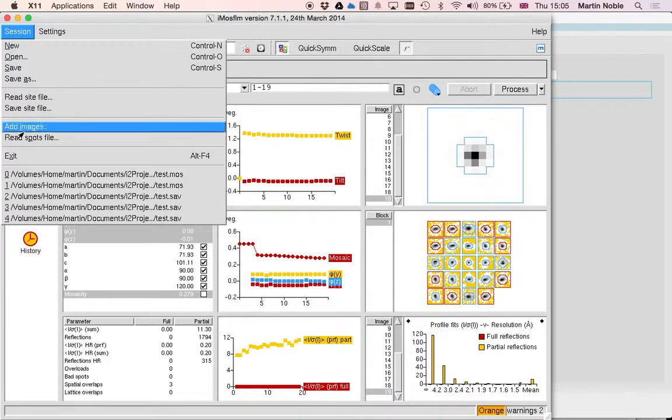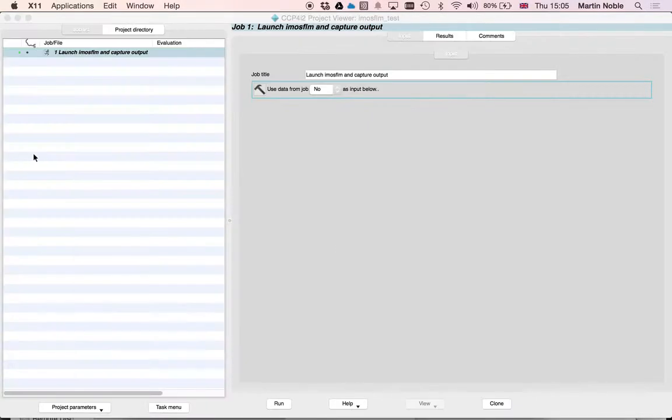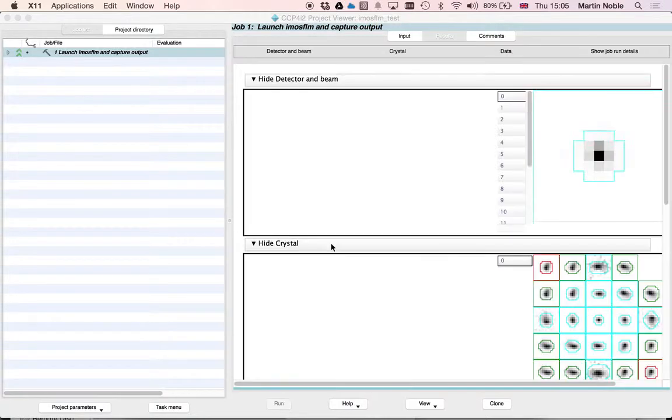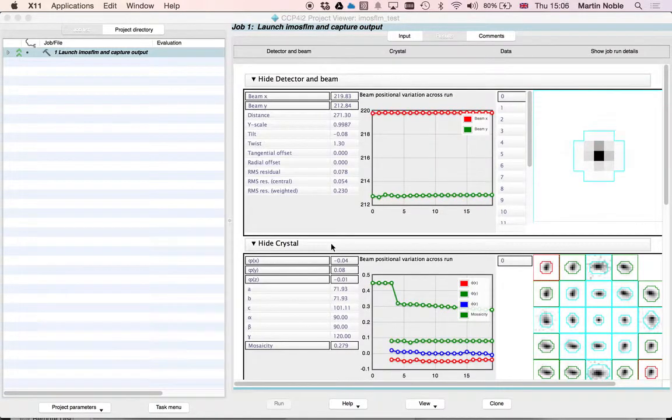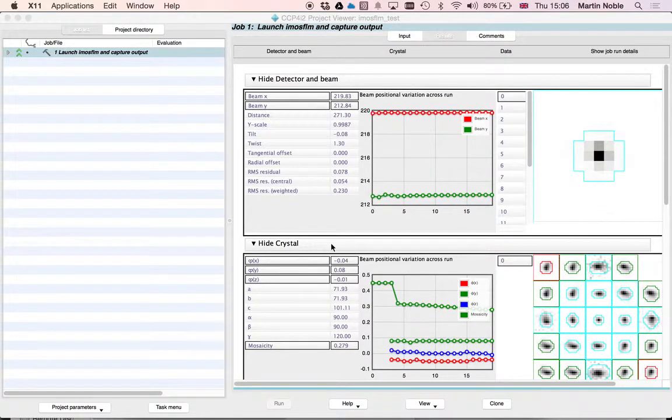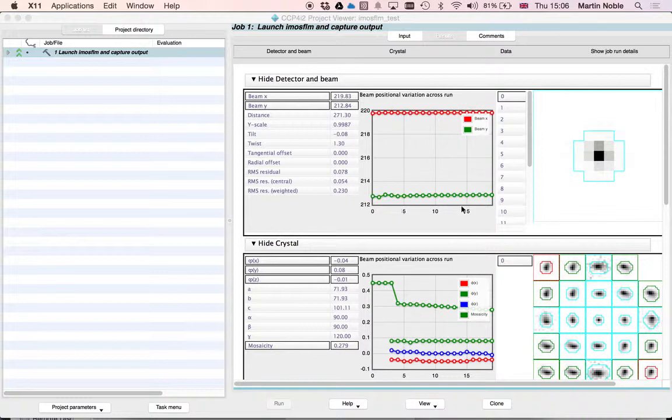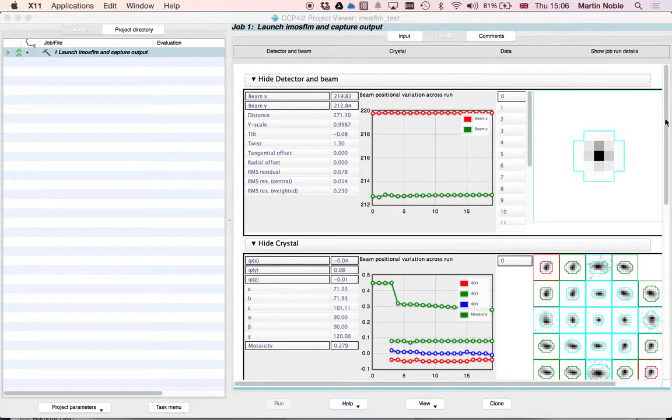So it can be anything .mos or .sav. And then we exit the session. And what you will see happen is that that session has been captured into ccp4i2. We can see a fair reproduction of the report.